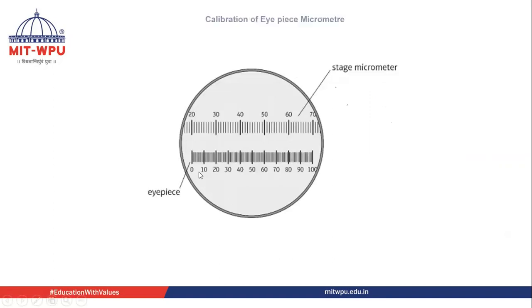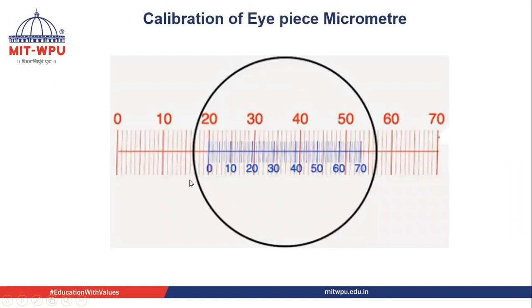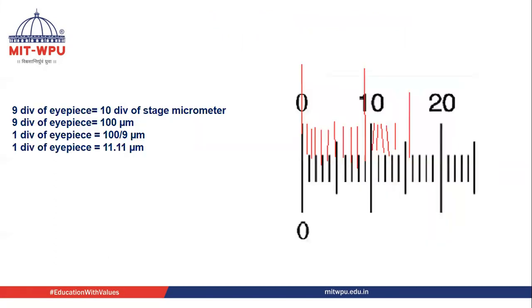If we look through the eyepiece, we can see both the eyepiece micrometer and the stage micrometer. The next step is to calibrate the eyepiece micrometer. We superimpose the first line of the eyepiece micrometer scale — represented in blue — with any line of the stage micrometer scale, shown in red. Here, I have superimposed the zero line on the 20th division of the stage micrometer. Once they are superimposed, we look for the next line where both scales coincide.